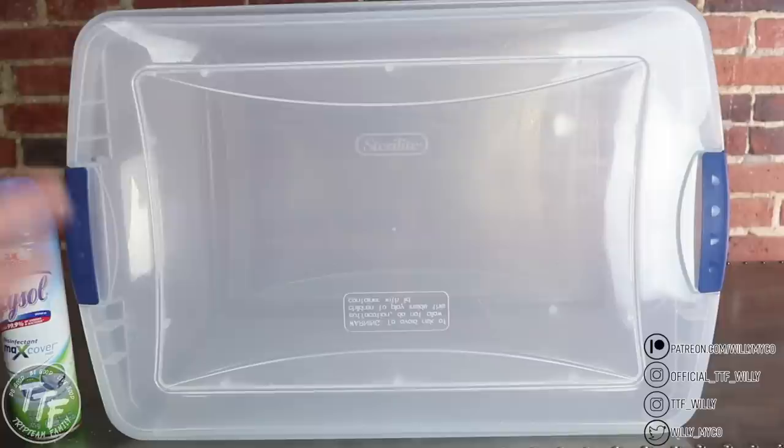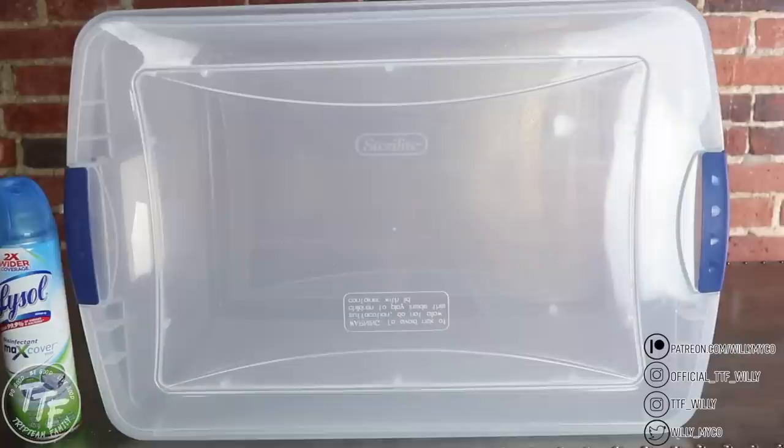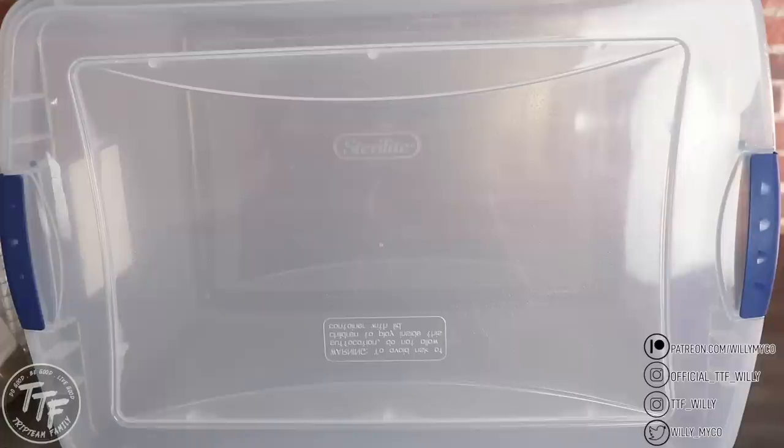Once you've sprayed the inside and the lid, put the lid on the bin and latch it closed. Now let it sit for about 10 minutes. You want to let all that air settle inside the bin. There's going to be disinfectant spray moving around in the air along with debris and air movement. You want all the dust that might be moving around inside the bin to settle and fall into the disinfectant covering the inside surfaces. Make sure you wait at least 10 minutes before you start working inside. This isn't exactly a still air box, but it functions like one — it's more of an open pour technique with a really high success rate.